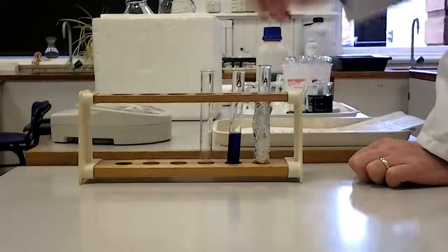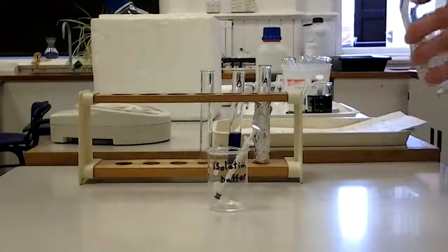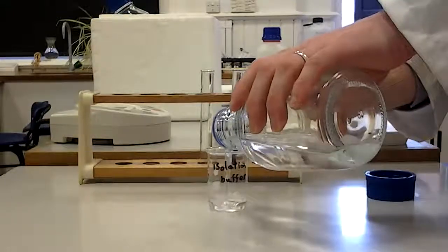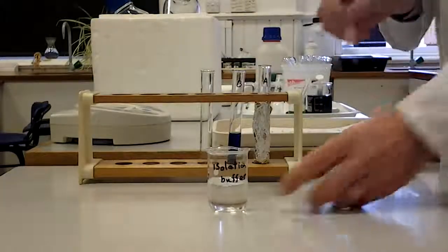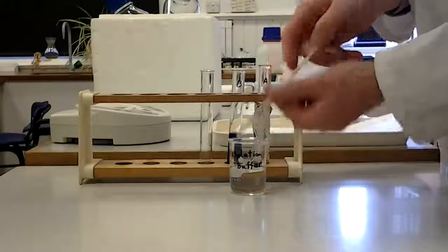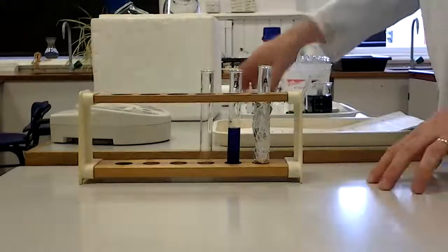I've put in my water, and now I'm going to put in some isolation medium instead of chloroplasts. So tube B has everything except the chloroplasts: tube A has everything but no light; tube B has everything but no chloroplasts. They both have equivalent volumes of liquid. Those are my two controls.